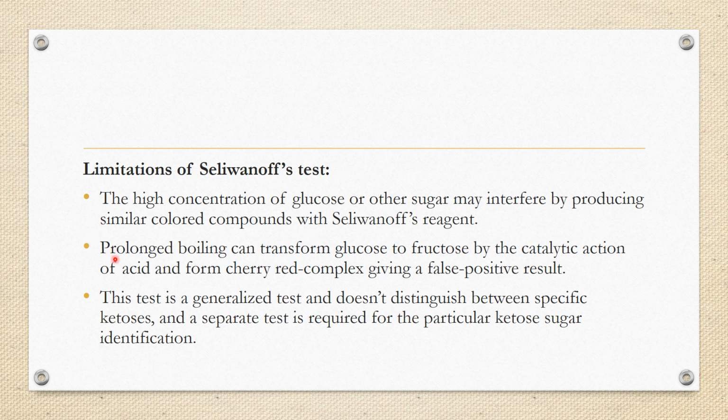And also prolonged boiling can transform glucose to fructose by the catalytic action of acid and form the cherry red complex, and this also gives a false positive result. Because of that, the boiling time is just 1 minute, not more, to avoid the false positive result.